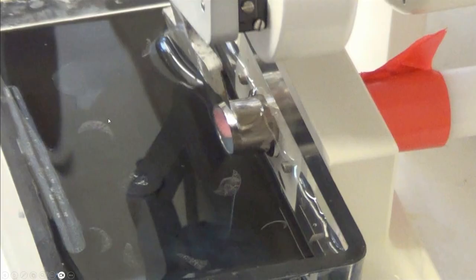You can see these mouse slices here are nice crescents that are cut from the tissue, and you'll have many of them that build up. Probably for a mouse lobe, you may have 20 to 25 slices. So if you were to do all 4 lobes for a single mouse, you may generate 80 to 90 to 100 slices, and that's a good production if you use all 4 lobes of a mouse.